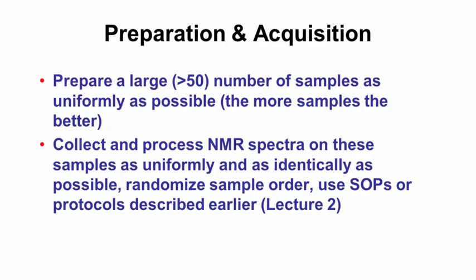So there's several steps for statistical spectroscopy. The first part involves spectral collection, which is not unlike any other beginning metabolomics experiment. As with almost any metabolomics experiment, you want to collect a large number of samples that might represent 2 different cohorts or 3 different cohorts, or they may be over different time periods. In statistical spectroscopy, more samples is better because you're trying to make use of the power of statistics to look for possible correlations or connections.